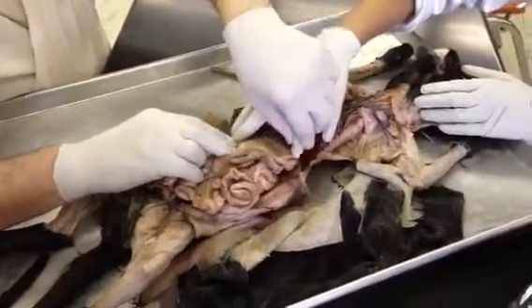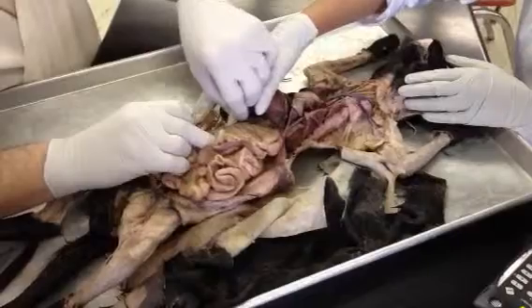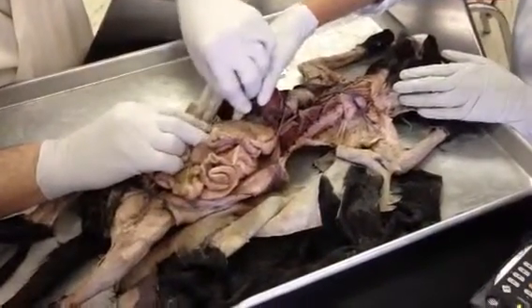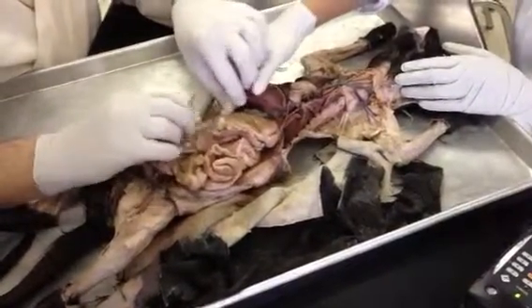Let me describe the greater curvature. There's the greater curvature right there. There's the lesser curvature. And right there, that's the pylorus. That's the end of the stomach where the stomach joins the small intestine. The small intestine here is the duodenum. You with me? Okay.